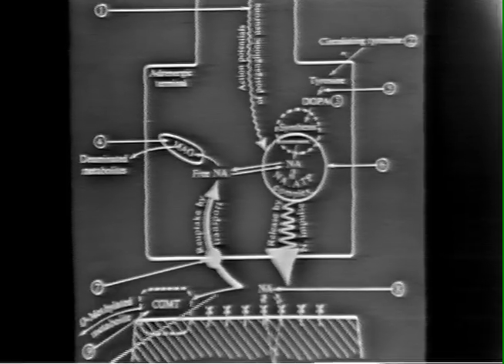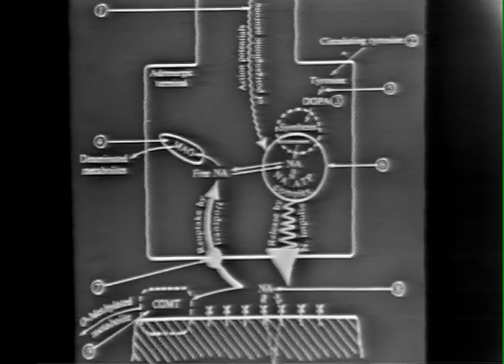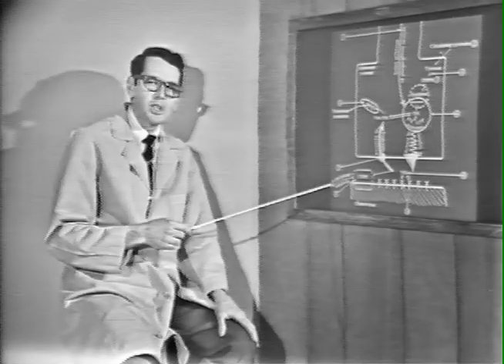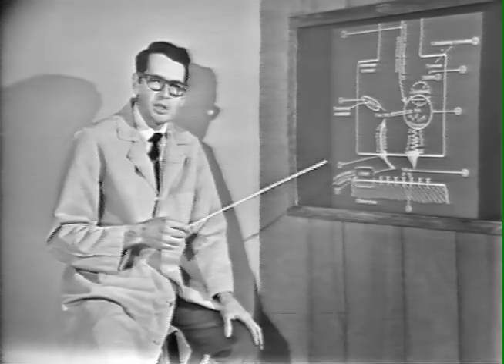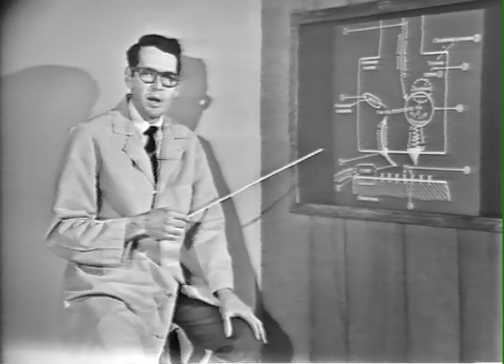Now, this same mechanism is reflected also in the duration of the response after cessation of stimulation. You notice that after stopping stimulation with 1 per second, the duration of the response was very short. The response, the elevated rate, came back towards normal very rapidly.